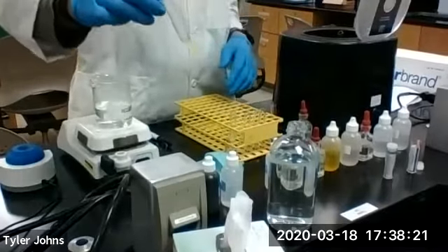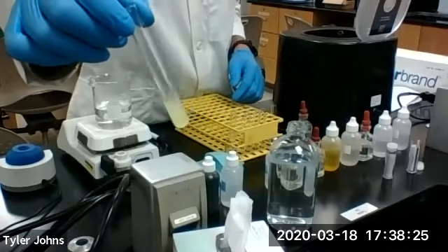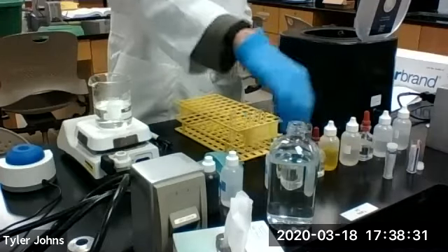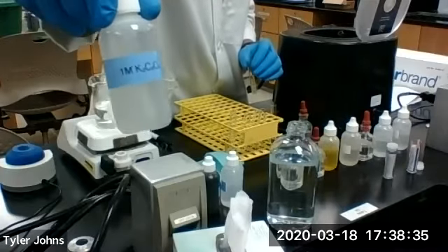At this point, we've added our 6 molar HCl and dissolved our calcium oxalate. So to confirm the presence of calcium ion, we're going to add 1 more drop of the 1 molar potassium oxalate.